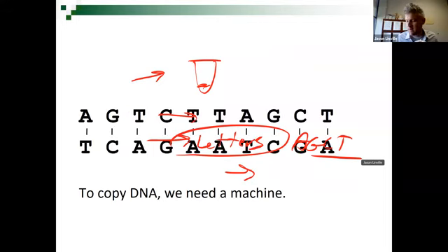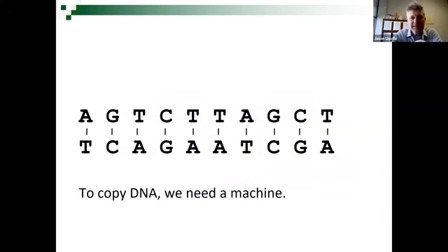Okay. So let's say that this is our DNA. It's a ladder: A is opposite T, G is opposite C, T is opposite A. So we've taken the ladder and just turned it on its side. If we were listing the DNA sequence, we would only have to list one side of those, but we're looking at the DNA molecule. We want to understand what's going on at the molecular level here. So we have our DNA.